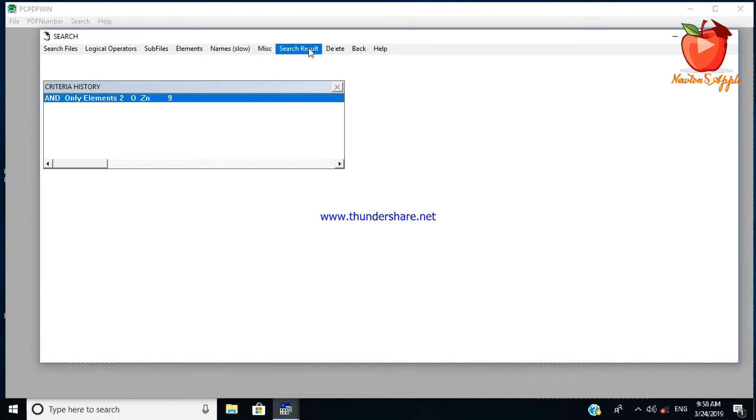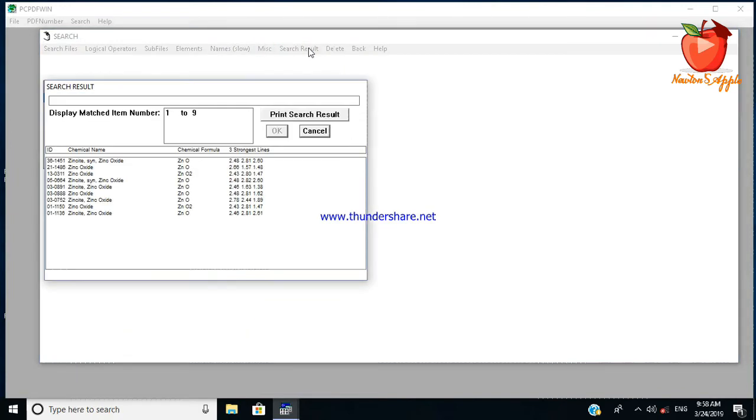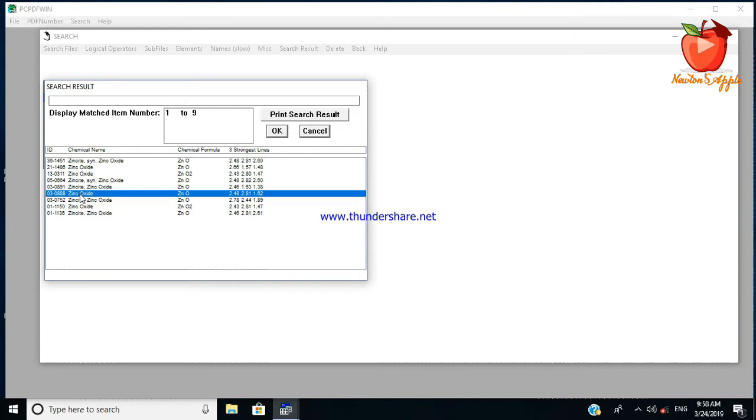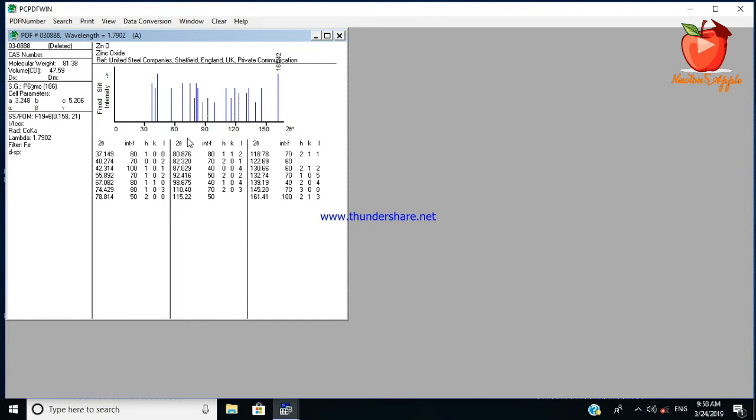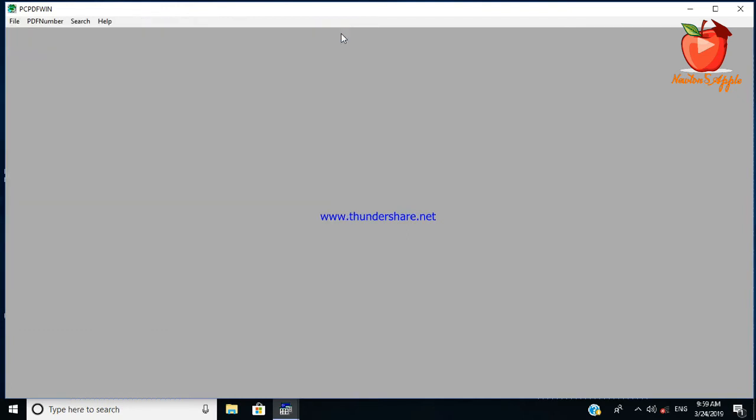I can select one of them by clicking. This is XRD data for zinc oxide. You can see this is a one zero one peak, the highest intense peak from this XRD data. On the x-axis you can see the two theta values and the y-axis shows the intensity.